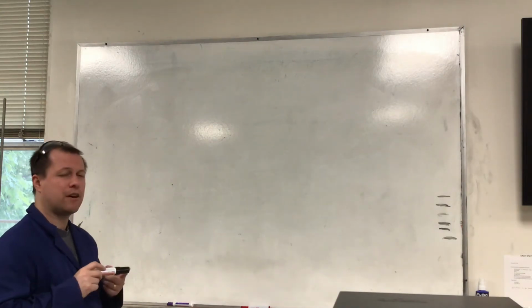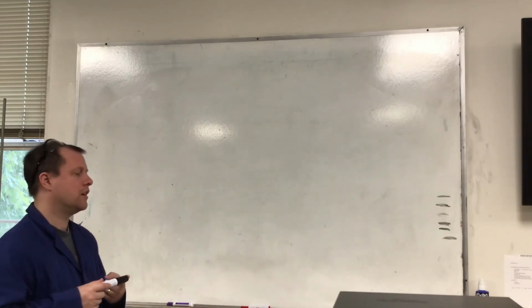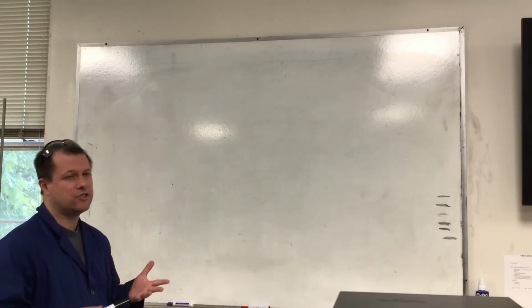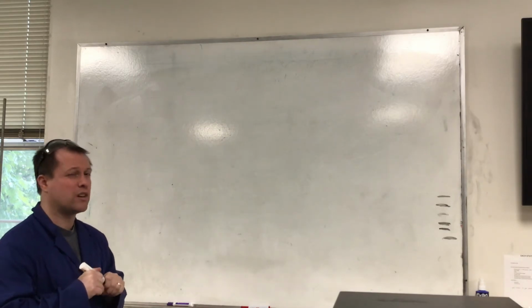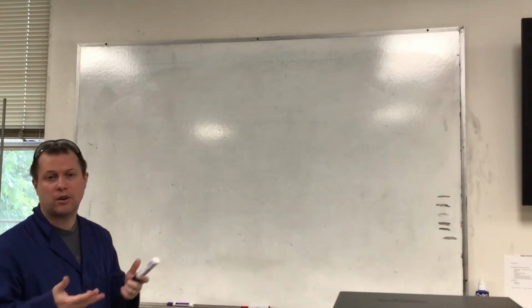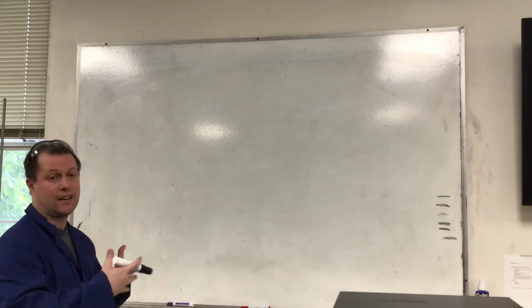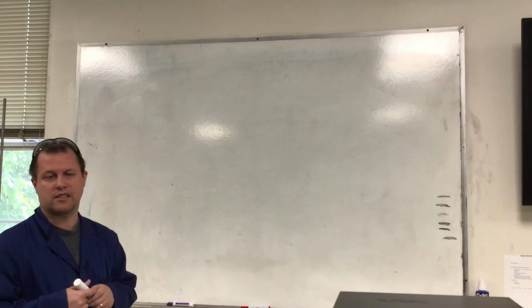We're going to be talking today about our molar mass experiment, a new variation on it that we're trying out. In this experiment, we're going to be talking about what's called boiling point elevation. To talk about it, we want to understand what it is, why it works, and what the main equation is that we'll use for the calculations in this experiment. Then we'll look at how that all ties into calculating the molar mass of something, and how we'll do that for urea in today's experiment.